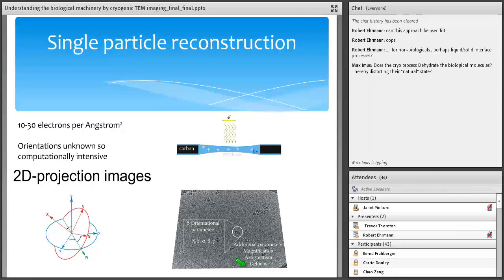Now, what we do is we mathematically solve for that convolution. If you're a material scientist, you don't need to do that. You can just simply work at focus and see the individual atoms. We can't do that because by the time we see the atoms, everything would be turned into ionized material. So water becomes superoxide radicals and hydrogen molecule gas, and then a bubble will pop, and everything will get broken down into the elemental. And it won't be a biological material anymore. It'll be carbon, oxygen, and nitrogen.